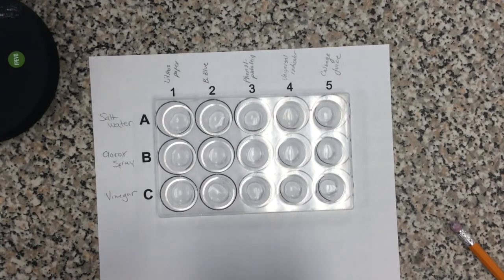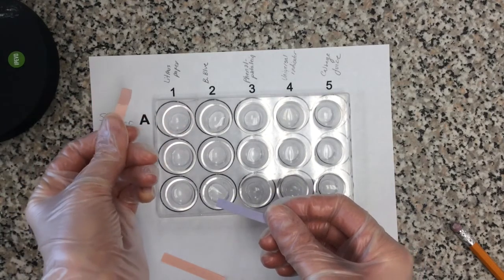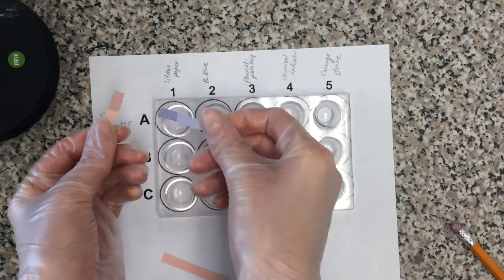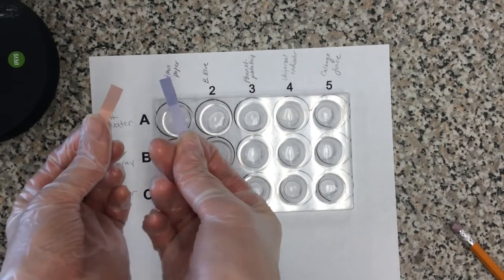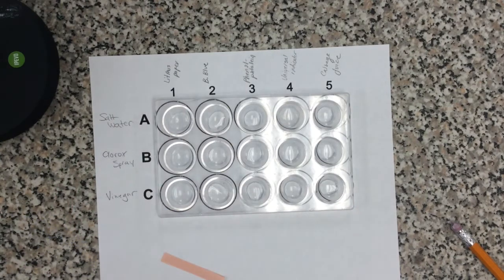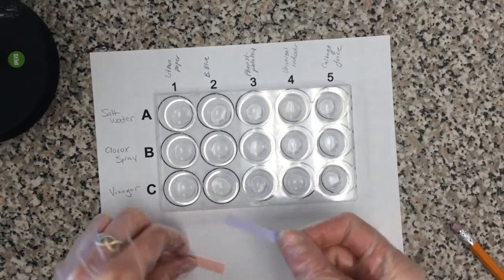Okay. There we go. So our red litmus paper stayed red. Our blue litmus paper stayed blue for salt water. So make sure you're filling in that chart. Our Clorox spray, oh, it's too blue, oops.